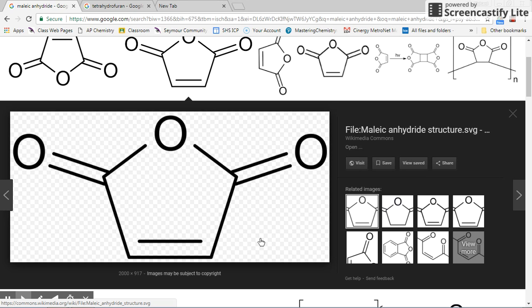Of course, it turns out that when we make the chemical tonight, when we produce whatever we make, it needs no further refining after you crystallize it. And once you crystallize it, it will not need to have any other purity test done. So as long as you just get that fairly dry, you should be able to do your melting point and get a fairly close melting point. But then that's not all.